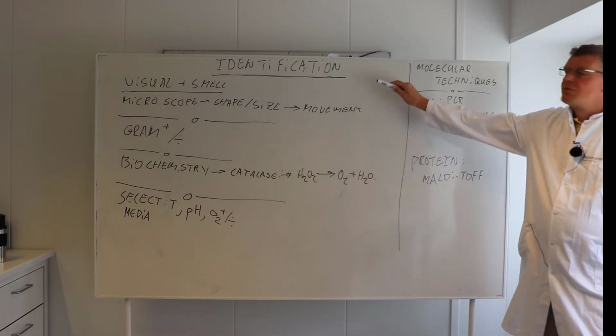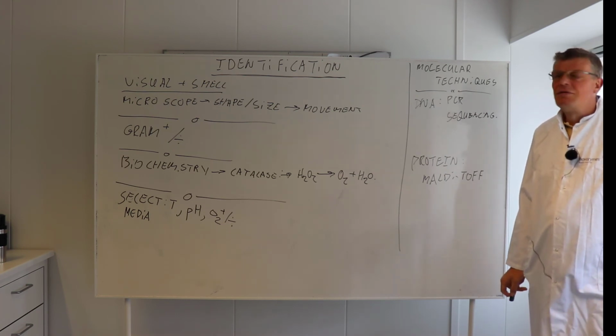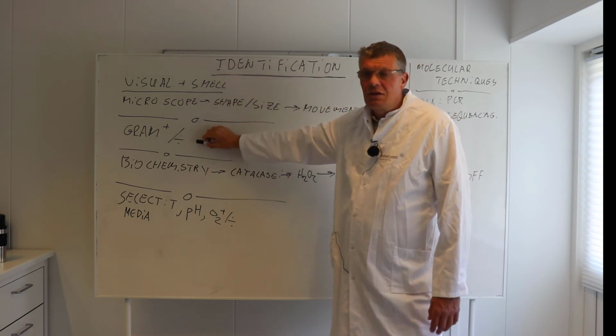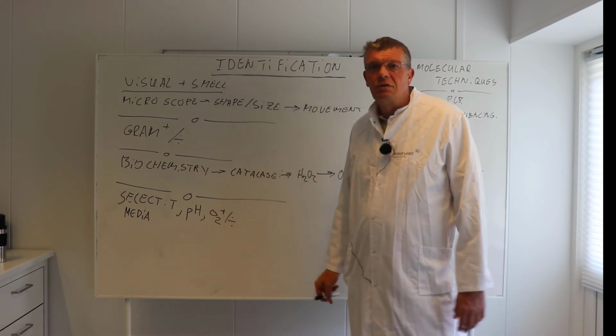So this video was about how to identify bacteria, what you have to think of, and a workflow. So visual inspection, using a microscope, gram stain, biochemistry, and maybe a selective media and stuff like that.